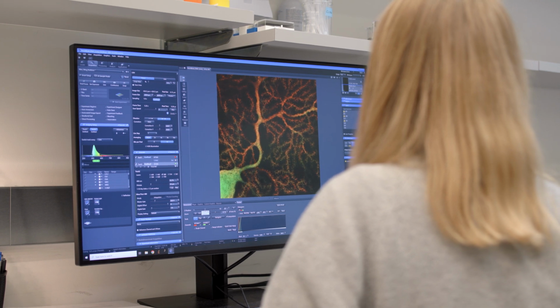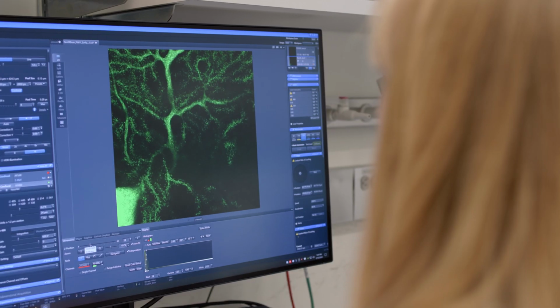While these images are certainly beautiful to look at, they're also supremely informative. We can watch cells pulling together to close a wound, or many other aspects of this dynamic process we call life. Modern biology wouldn't be where it is today without being able to use fluorescence to make our invisible world stunningly bright.